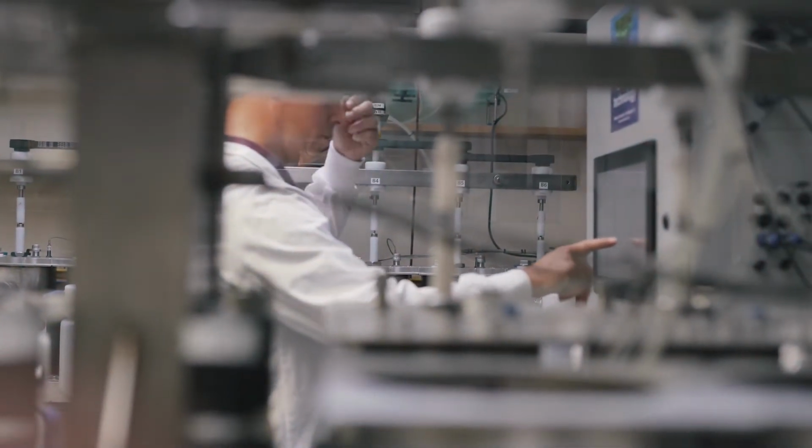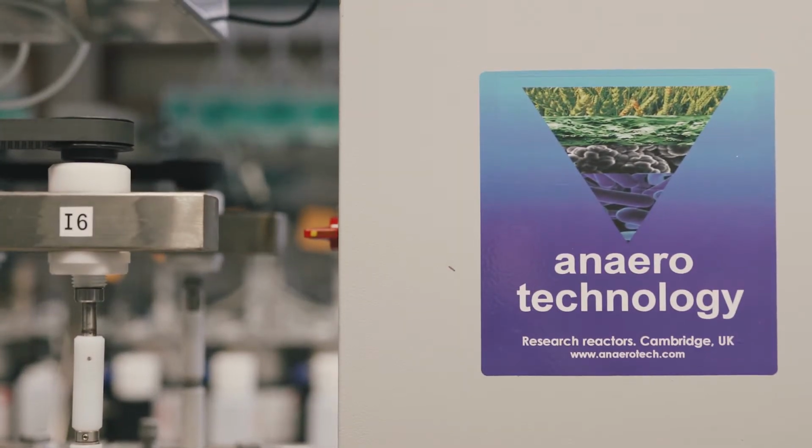Hello, my name's James Chong. I'm a professor in the Department of Biology at the University of York. Welcome to the System 60 lab, which is part of the Optimizing AD project with Yorkshire Water.